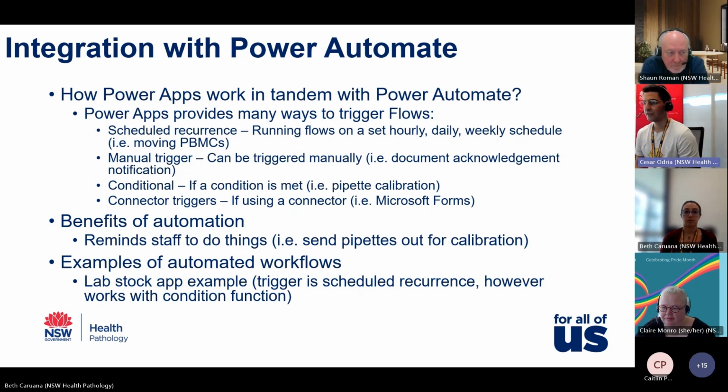There's also manual triggers, which can be triggered manually. So for example, when a new document is published, I can click a button that will send an email to everyone saying that there is a new document to be acknowledged. Here's a link, please read it.